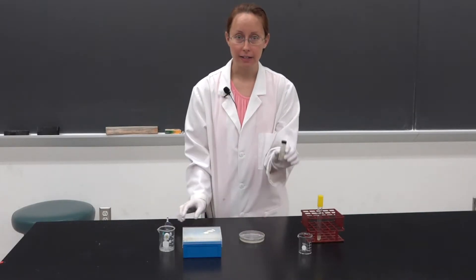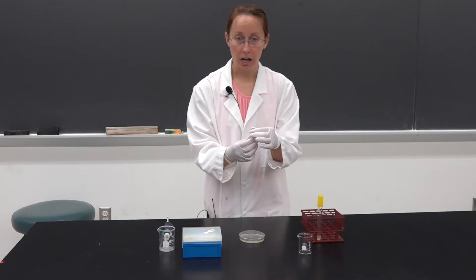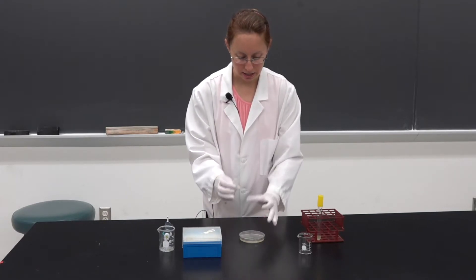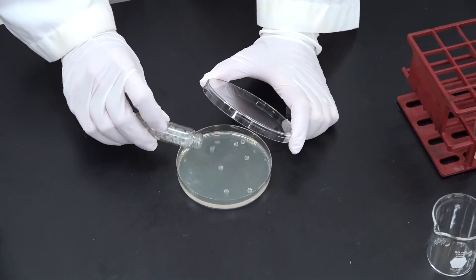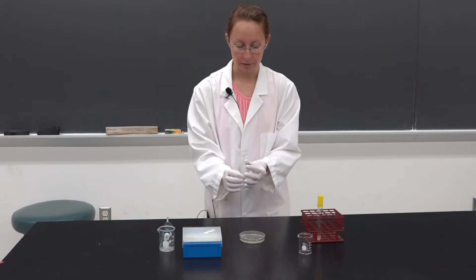Dispose of the tip and then get your glass beads. Unscrew the cap and shake out a couple, about half a dozen is enough, onto the surface of the plate.